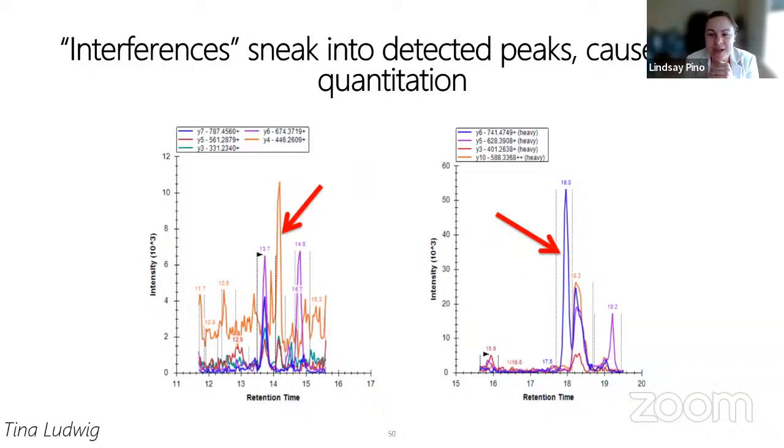So there was discussion about how good the data looked before. We're definitely going to be looking at much messier data now. But this is what I mean by interferences, and why maybe the commenter was saying, wow, this data looks perfect, but what about real data? This is more maybe what you'll see in real data. So where exactly is the peptide?